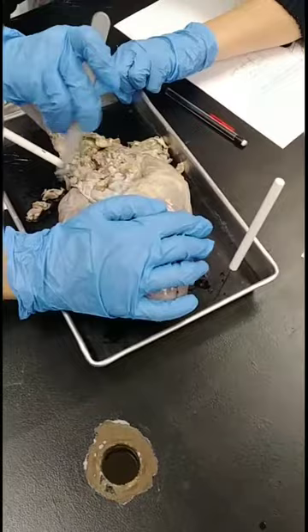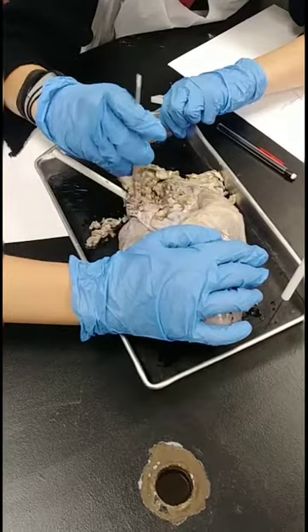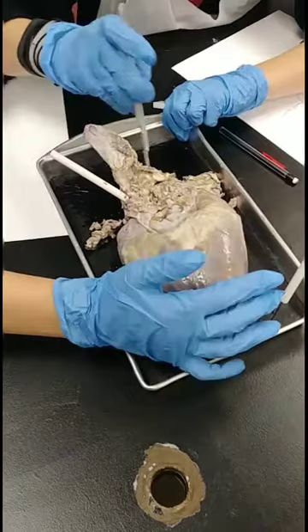You see this? This is very thin, one of the veins. The probe there, the aorta, is much thicker. Compare that thickness to this big one. I can see it through this. Yeah, like a metal pin.